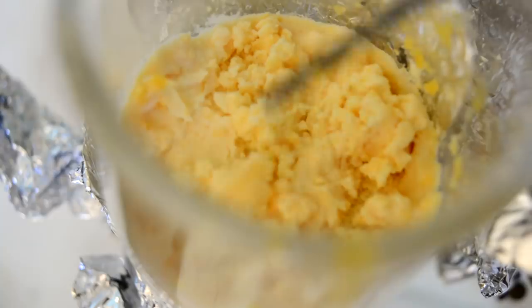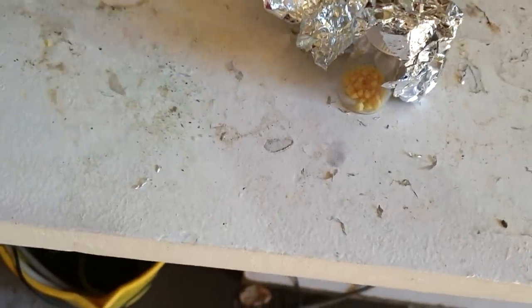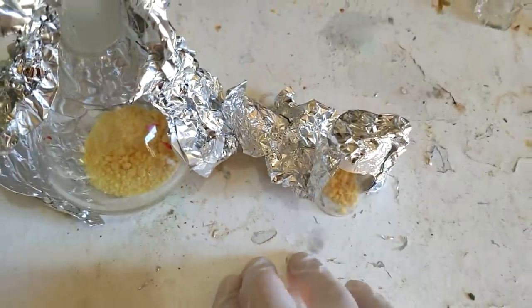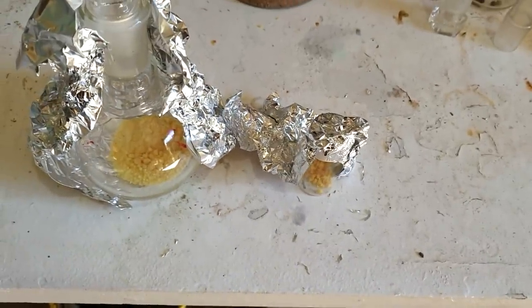Here we go. Here's our final yield. This is the first little batch that I tried out. It is a little bit yellow, but it did lighten up considerably with some ethanol washes, so I'm feeling really confident about it. All in all, we got 17.5 grams, 43% yield, which isn't great, but also the papers that we're following only get around 50 to 60% yield anyway, just for this step. And so I'm really happy with this.